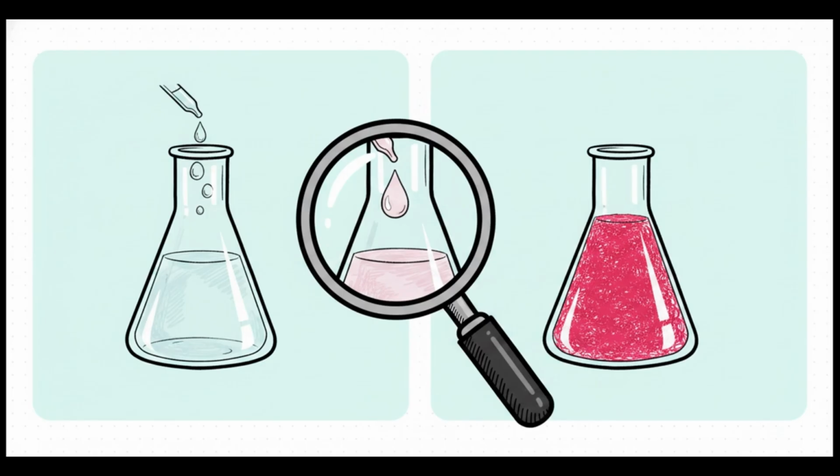The truly frustrating part? Finding that precise endpoint where a single drop turns the solution pale pink and it actually stays that way. I mean, we've literally all been there in the lab, accidentally adding that one extra drop and just watching the flask turn screaming magenta.